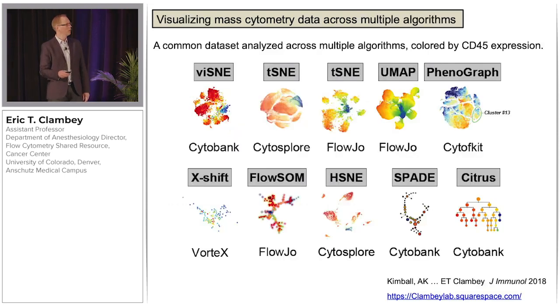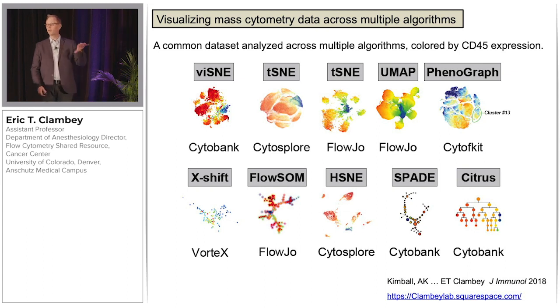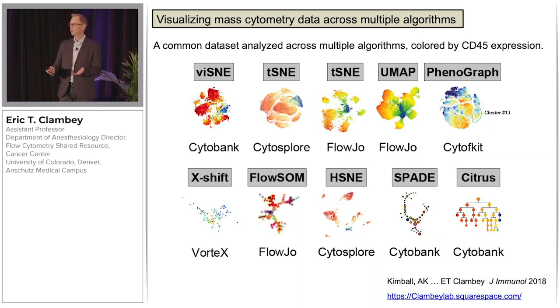Okay. Now, one thing that I found very challenging at the onset of CyTOF analysis was how the data are visualized. This is one data set analyzed with 10 different methods. In the top row, and this is all colored by CD45 expression, are five methods that afford single-cell resolution. In the bottom row are five methods that afford cluster-level resolution. There is not a single right way to analyze these data, and multiple of these approaches can afford unique insights into your data.